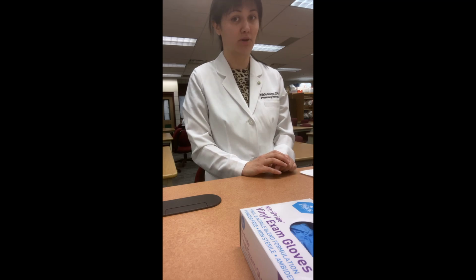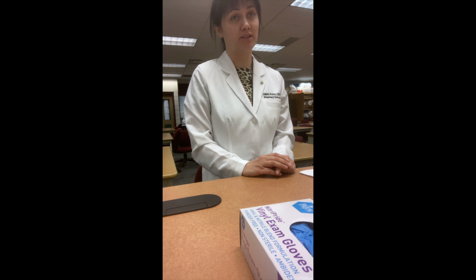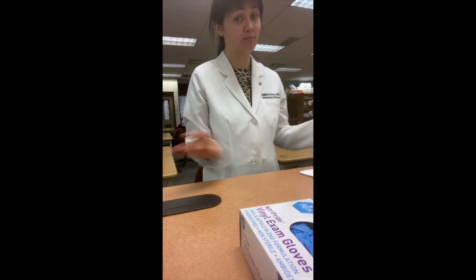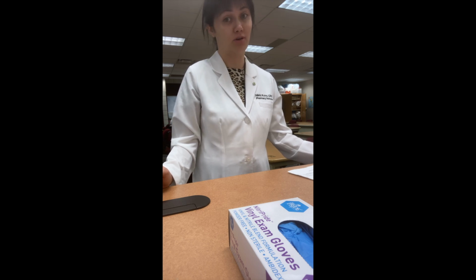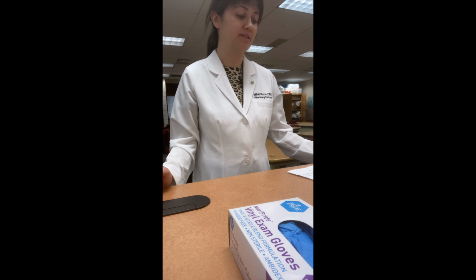At that point in the year, we're going to practice non-sterile compounding utilizing USP 795 standards. So this is the paint lab. This is when we practice measuring and mixing. Today we are going to pretend to compound a medication while making paint. The steps we're using can easily be related to non-sterile compounding.